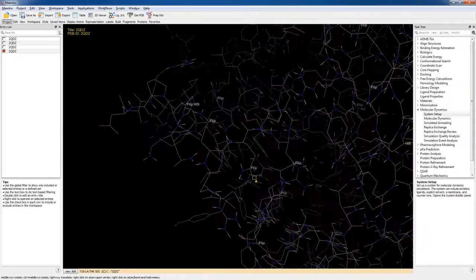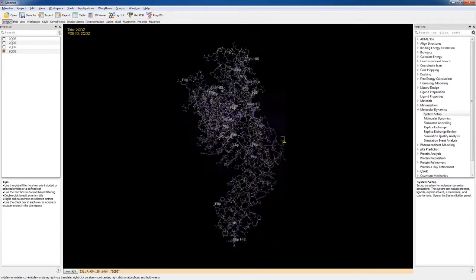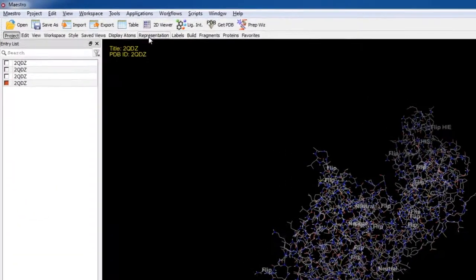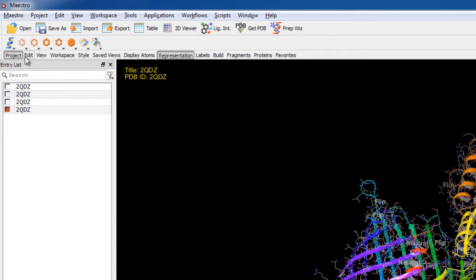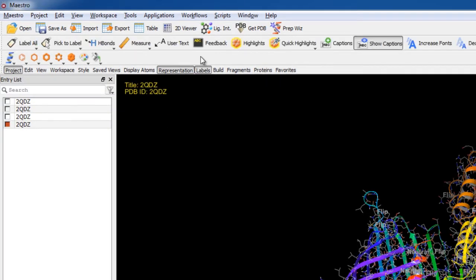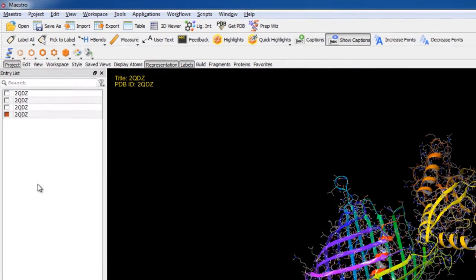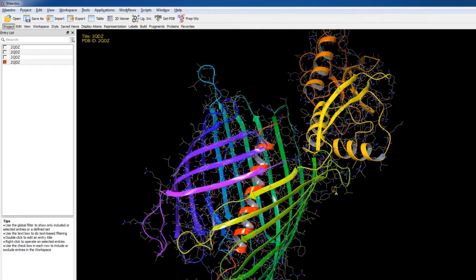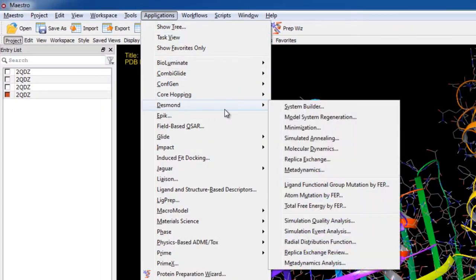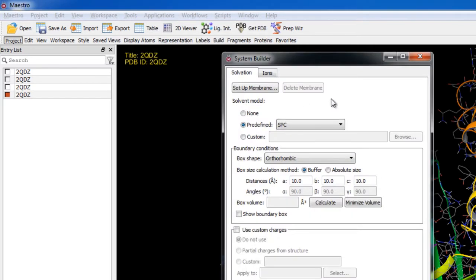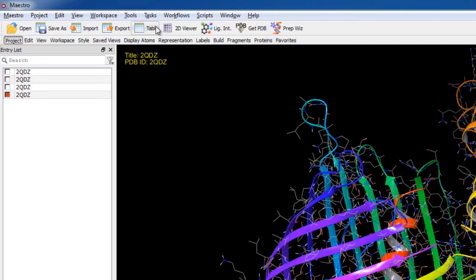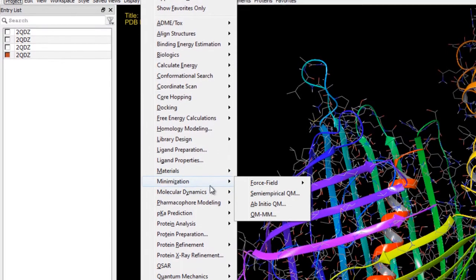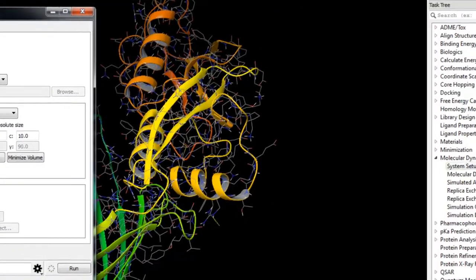Now we have a prepared protein ready for the system builder but first let's also show the ribbons to get a better representation of the secondary structure and let's also delete the labels. Now let's go to applications Desmond system builder or if you're using the task view mode just go to tasks molecular dynamics system setup or search for the system builder in the task tree.